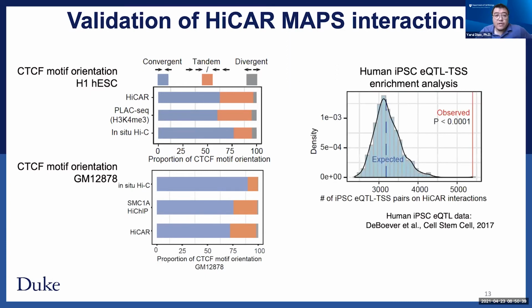And next, we also compare the enrichment of eQTL and TSS pairs that have been identified from a previous study analyzing human iPS cells. And indeed, we found that the iPS-associated eQTL TSS pairs are significantly enriched in the H1 HiCAR MAPS interactions compared to the background.